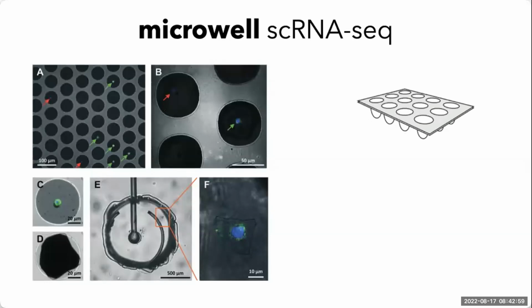That in turn helps us avoid heterogeneity in the cells, or helps us select cells of specific types for which we want to perform this analysis. And this strategy is extremely useful in situations where, as I mentioned, one wants to isolate a specific subset of cells for sequencing. Another advantage is that one can take pictures of these cells, which provides an additional modality and useful applications to quantify the cells, to identify damaged cells, or to identify doublets in a specific microwell, etc.